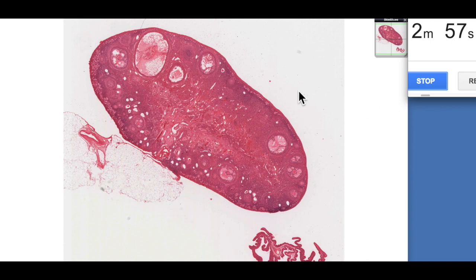The ovary exists within the pelvis in the female. It's often described as being almond-sized, and it has an outer cortex within which we find the follicles at various stages of development. You can see all of these follicles, and we'll have a separate video looking at follicle structure a bit later, and then also an inner medullary region.